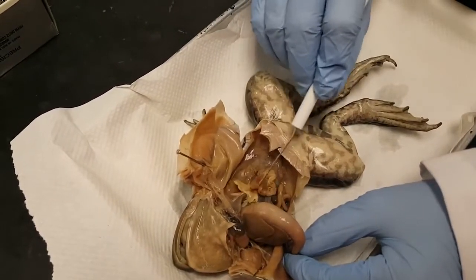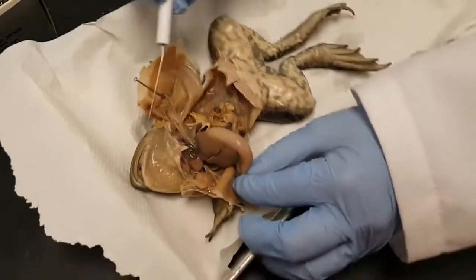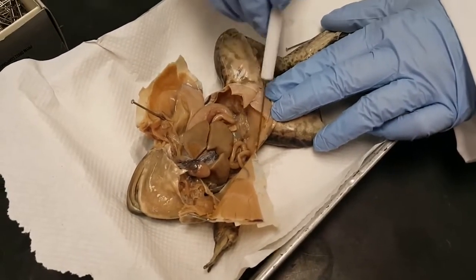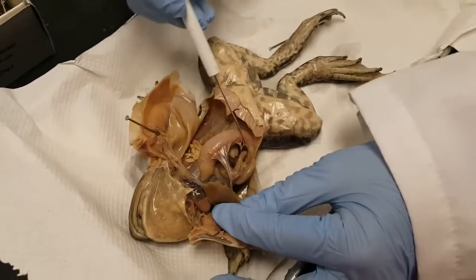This stuff that's kind of yellowish is a fat body. Some frogs are fatter than others, but this is kind of a skinny frog. We don't see any eggs, so my initial observation is this is probably a male frog, but we'll find out when we look for its testes. Now we're going to follow the stomach down.